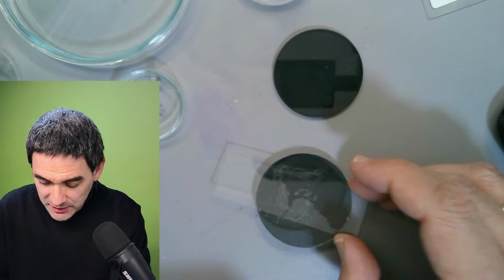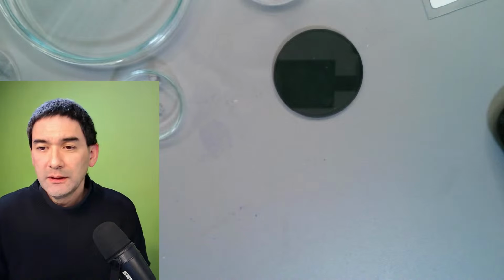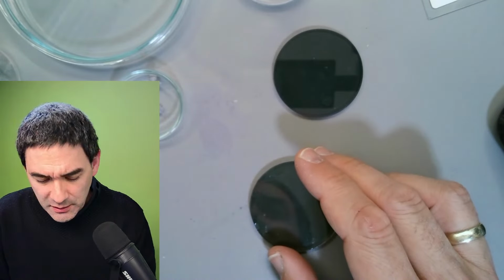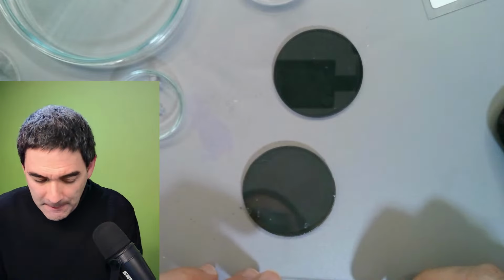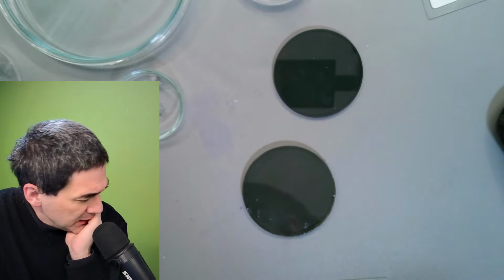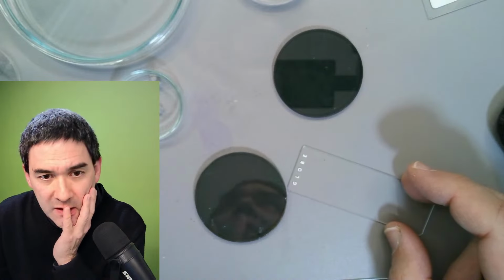So the desk view. Let's try it. How am I going to try this? What's the best way to try this? Well, I think I'm just going to put a little bit of this cotton here. I'm thinking what the best way would be. You see, if I put cotton directly on a slide, then there is the problem that it's not flat.